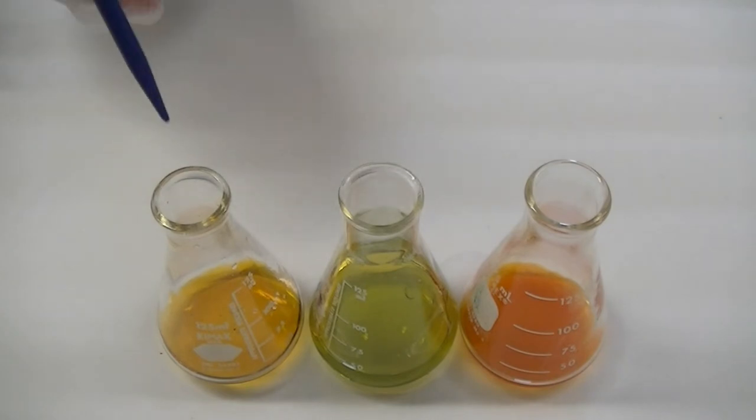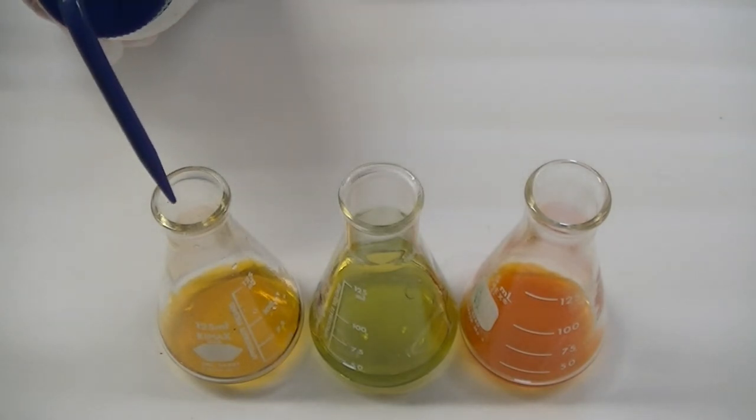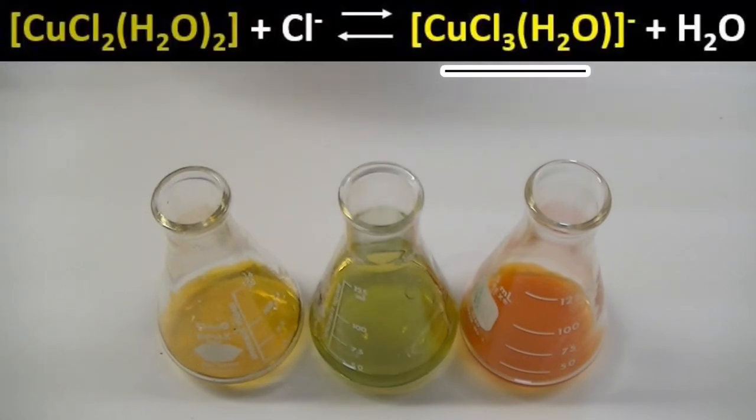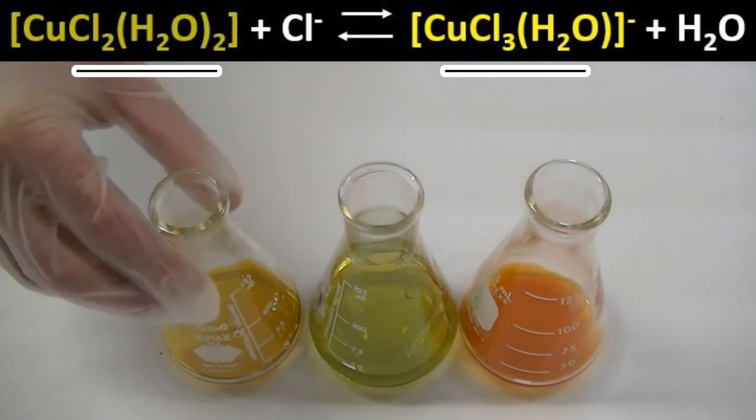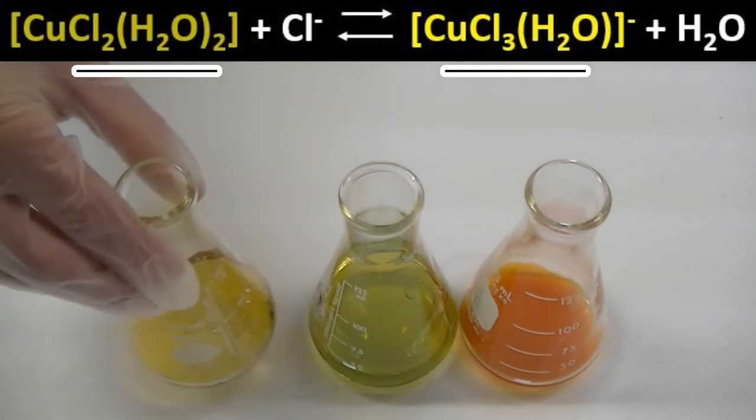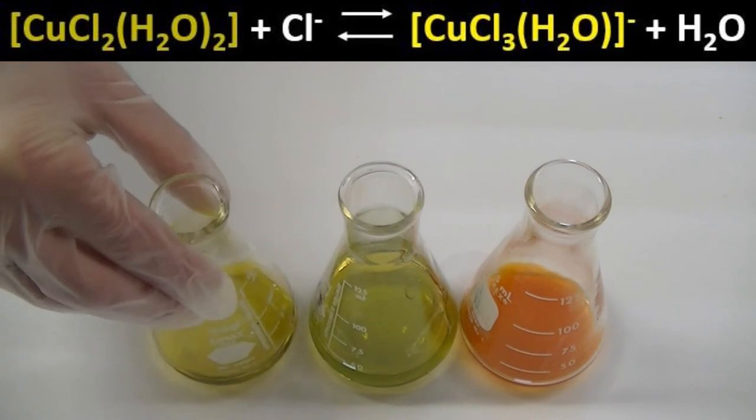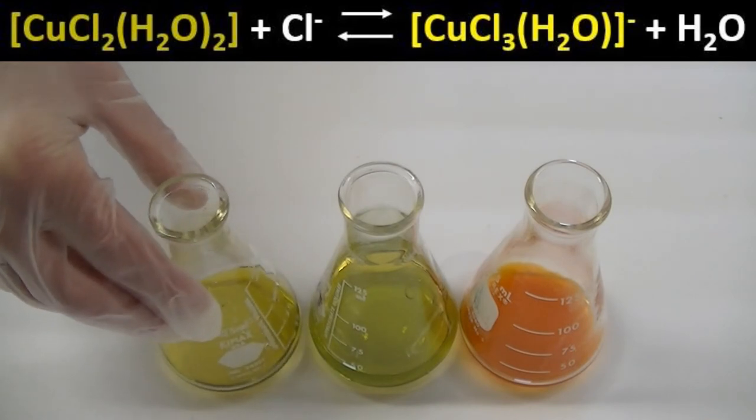Further addition of water induced a color change from yellow to green-yellow. This color change involves the equilibrium between trichloro and dichloro-copper complexes, as seen in the equation above. Again, water shifts the equilibrium from right to left, inducing the color change observed.